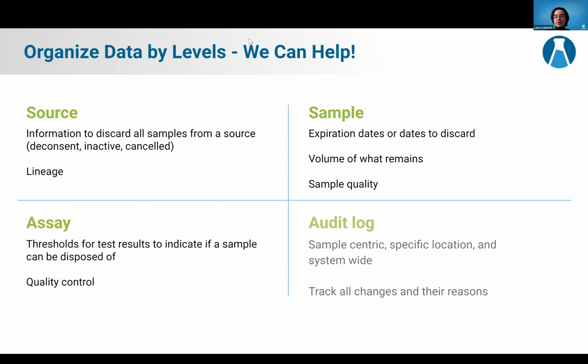As we're capturing all this data, it's super important to realize that we are tracking all of the changes you're making to the system. We keep track of the samples from the moment you register them to when we dispose of them. So our audit log is always going to be there as a backup, so you can go back and look: why did we dispose of these samples? Was there a specific reason? Who did it and why did they do it?